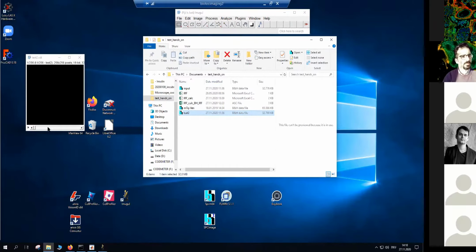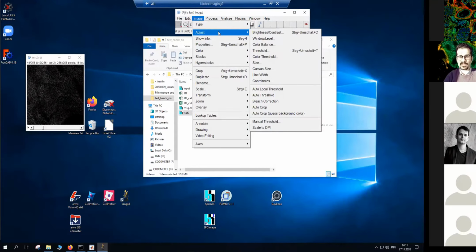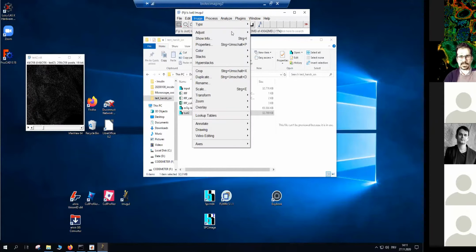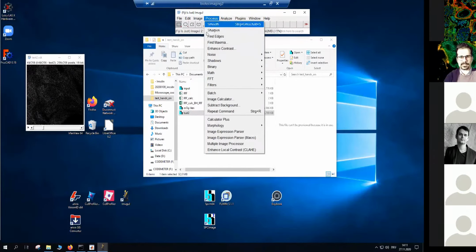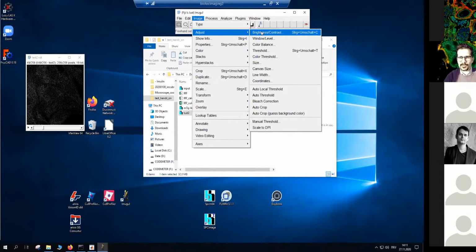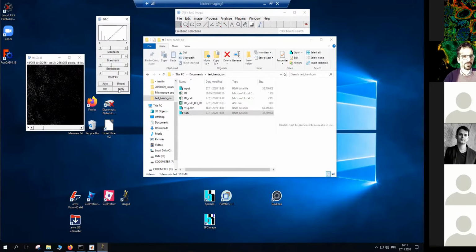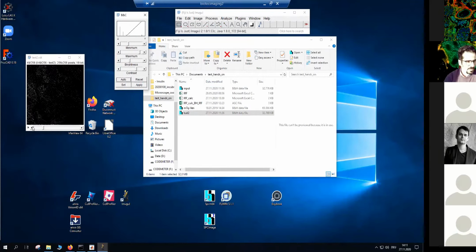Anyhow, when I open it, it seems like a time lapse, where sometimes the intensity is increasing and then decreasing again. So what is this one? Let me go to the image and adjust the brightness. Okay, for a second the remote connection to the image processing desktop was not happy. So brightness, and then I just say auto, no apply. I never click apply here, because I don't want to change the intensity distribution of my actual image. Now it seems that there is not much of an intensity.